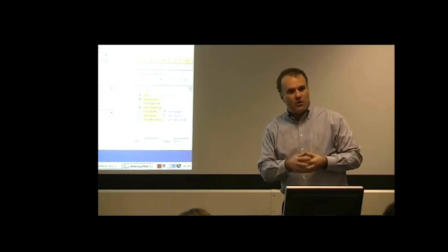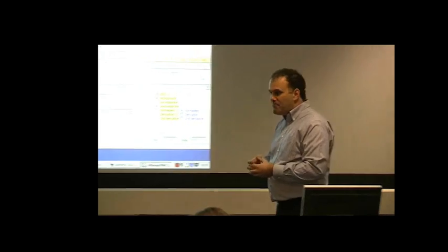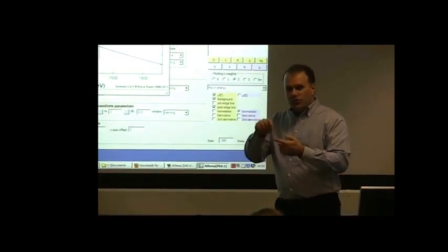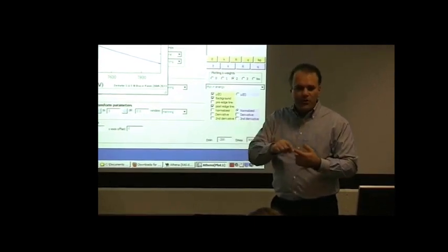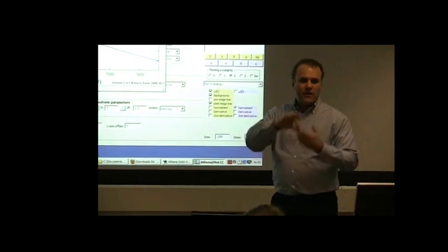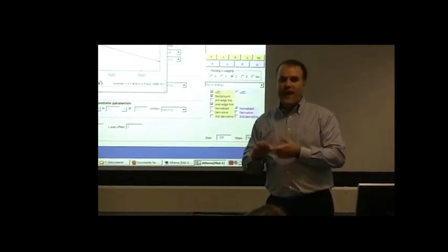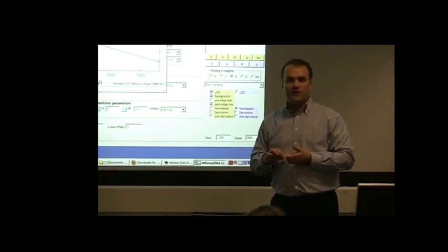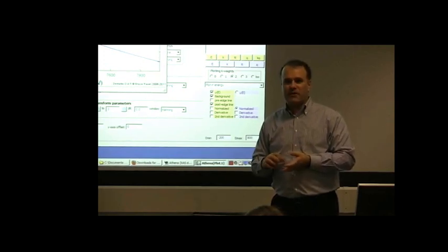If you do that, that doesn't prove that you will do the data processing consistently for the real data. What it will do is give you some confidence that you can do the data processing in a defensible manner. And that, for better or for worse, is sort of the best answer I can give you. And you seem to be nodding, so it seems like you and I are probably in agreement that that's the best sort of thing you can do.